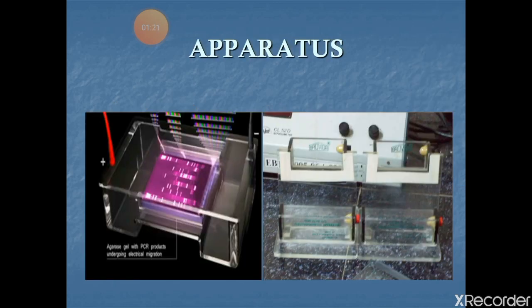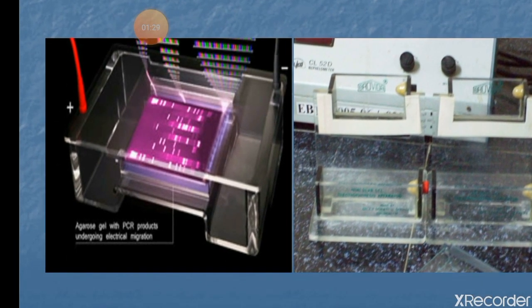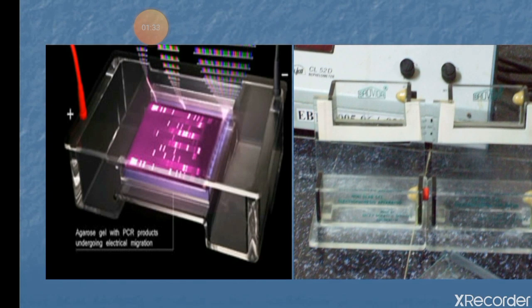Here is the apparatus for southern blotting. This is the electrophoretic pattern. Electrophoresis is done in order to separate the DNA depending upon their sizes. Charges will be supplied on either side. You can see the chambers. Charges will be applied on either side, and the DNA will be separated depending upon their sizes.